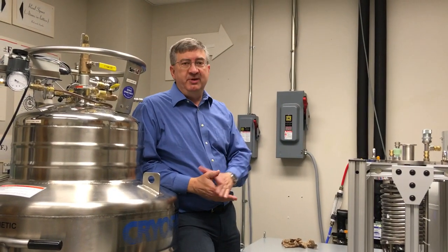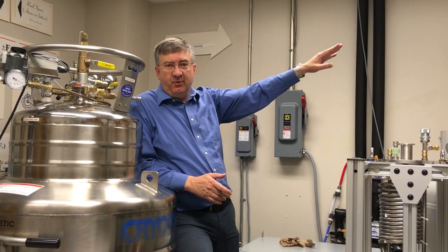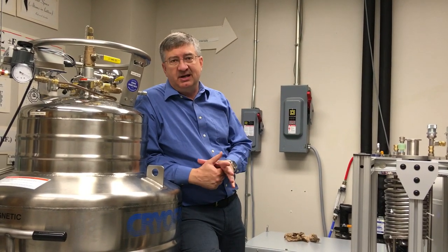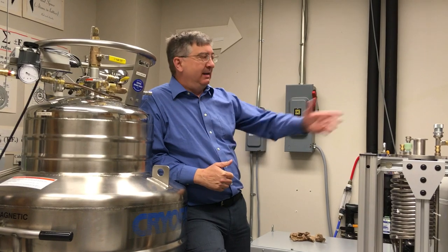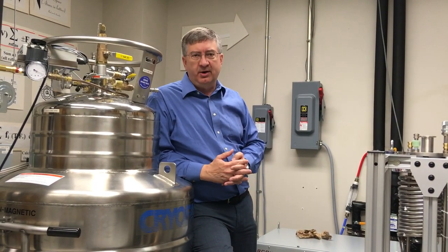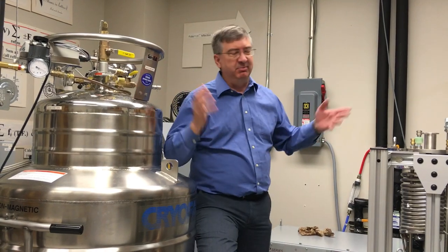From the balloon in the other room, the helium comes in through a pipe over here on the wall and hits this compressor behind me. That compressor takes it up to about 300 pounds per square inch and puts it in these tanks — that's just to store it, keeping the volumes lower than they would be if we were storing big balloons everywhere.